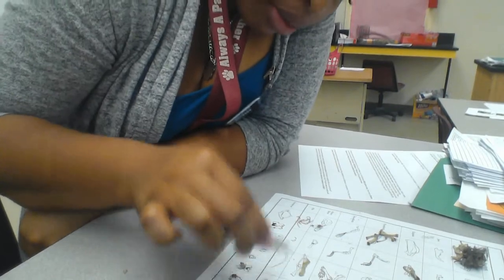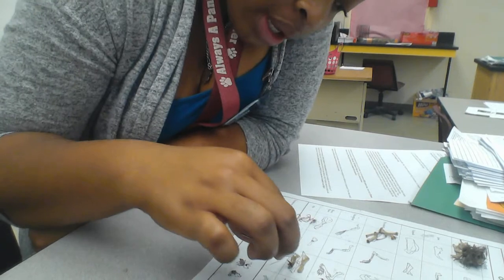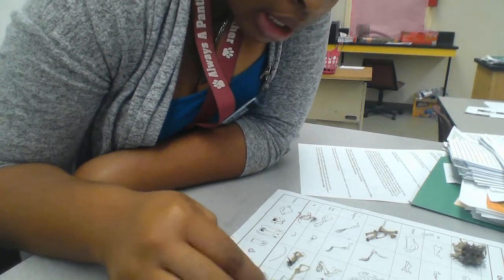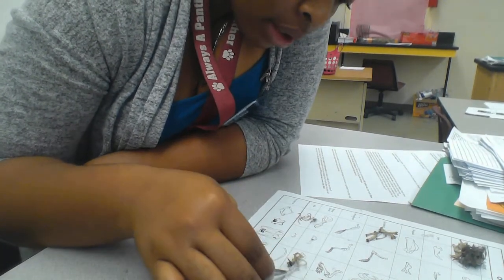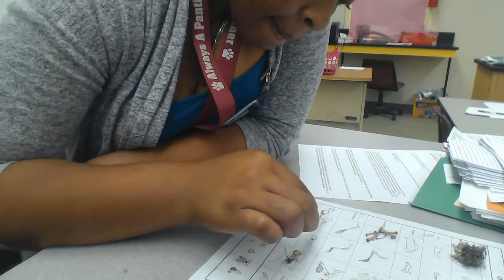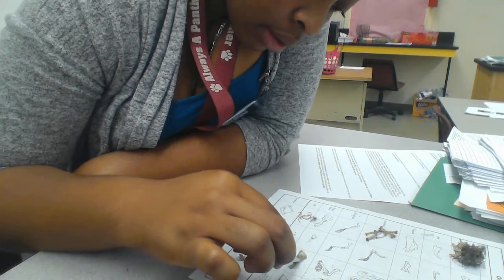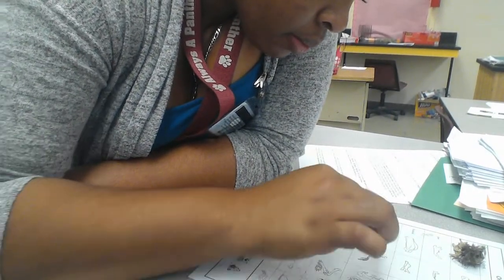That's a pelvic bone of a mole again. Or, you know what? No, it's not. Okay, so I lied. Don't tally this pelvic bone as a mole. Clearly, these are pelvic bones of rats, because even though they look alike, we've been seeing so many rats, I want to say that these are pelvic bones of rats. So I'm scooting them over to pelvic bones of rats.